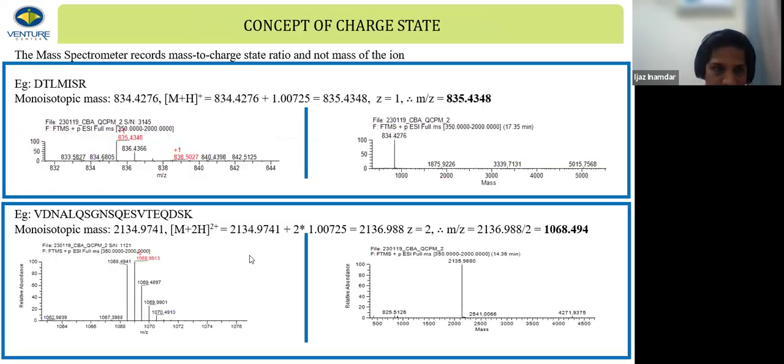Now, a couple of slides remaining. Just bear with me. Let's talk about monoisotopic mass and how you actually get the spectrum. I'm going to show some data that we generally detect. The first and most important thing is that we need to charge the molecule. Neutral molecules will not be detected by mass spec. Because neutral molecules are not detected, we detect not the mass but the mass to charge ratio.